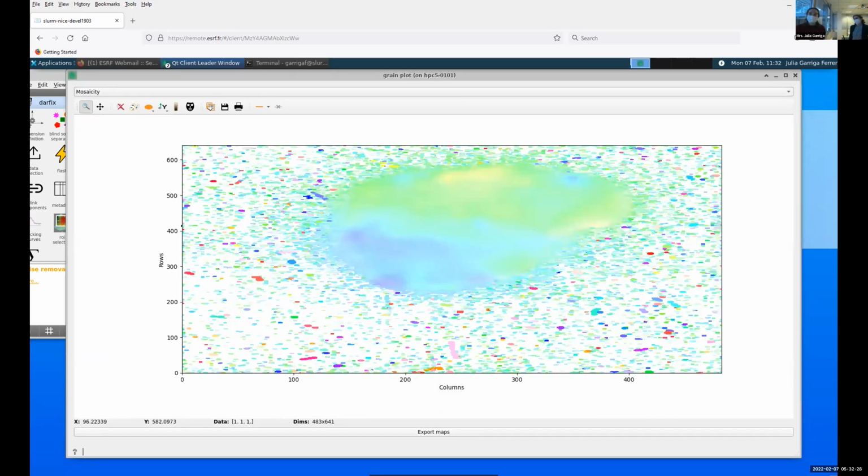Now it starts to be better. As you can see, the white begins to appear, but some still appears. So for now, we can leave it like this. After this, you already see the borders well defined. So after this, we can post-process.